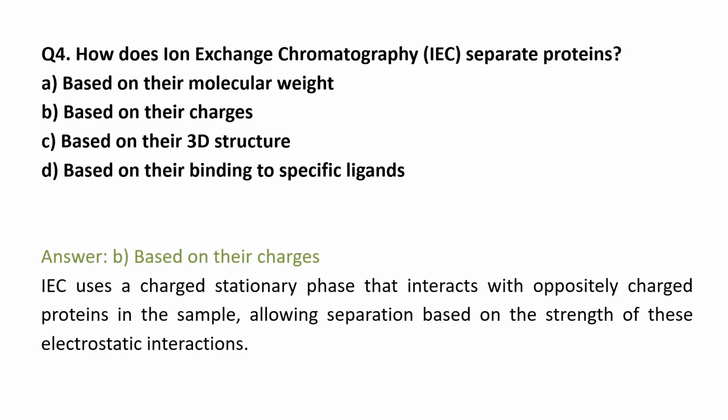Ion exchange chromatography separates proteins based on the differences in their net charge at a specific pH.